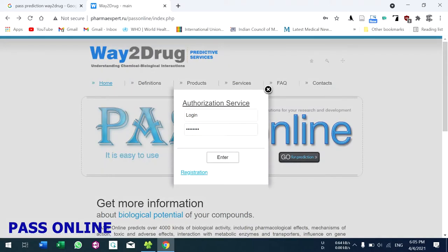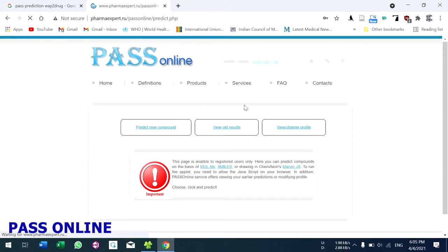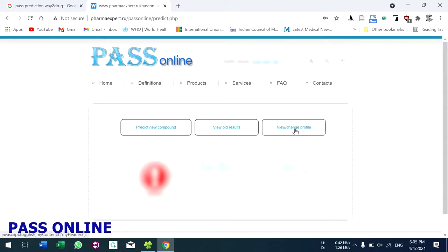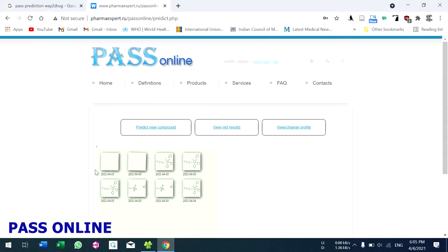Go to prediction, log in with your account, and press enter. You have three options: first is predict new compound, second is view old results, and third is view or change profile. You can change your profile details, update information, and change your password here. You can also view old results.